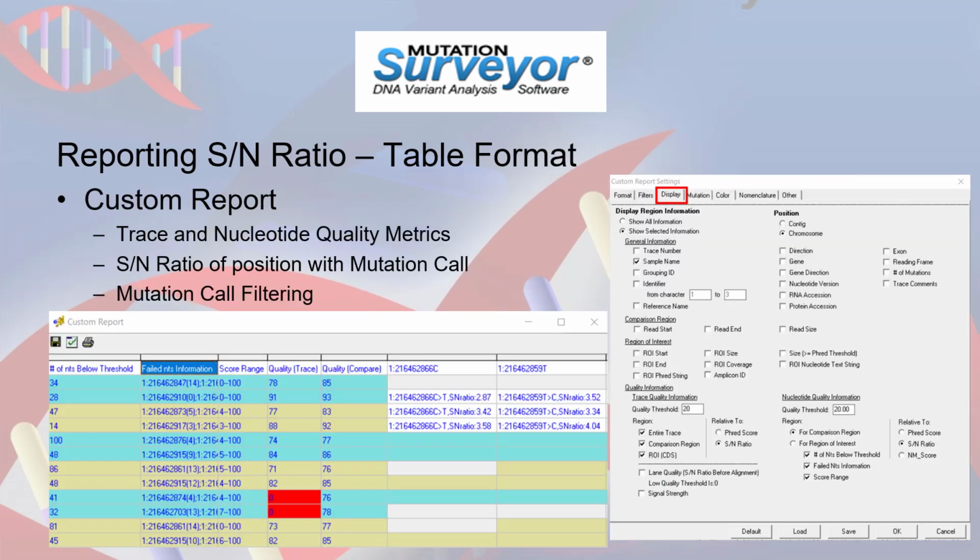The other report to provide signal-to-noise ratio information is the custom report. In this report, signal-to-noise ratio information can be used to measure and report both trace and nucleotide quality. Use the settings available on the Display tab to output the desired information relative to trace information.